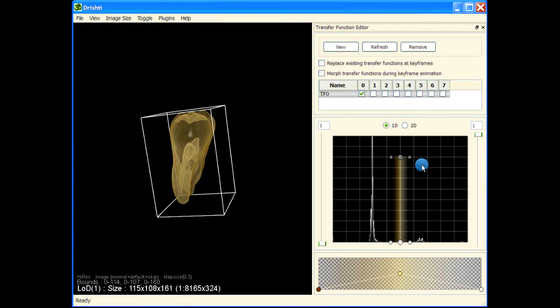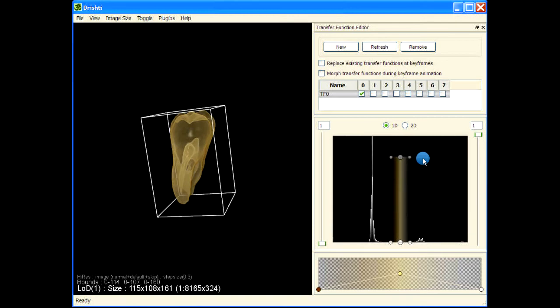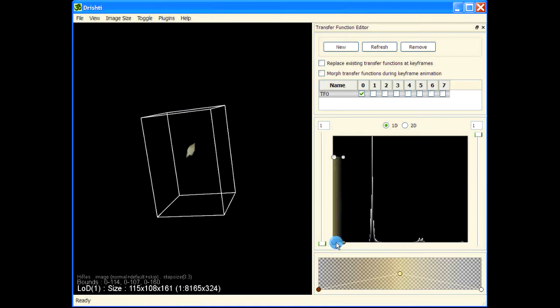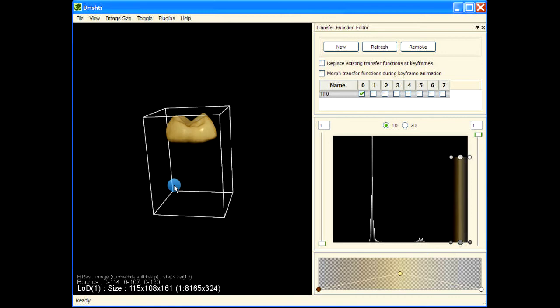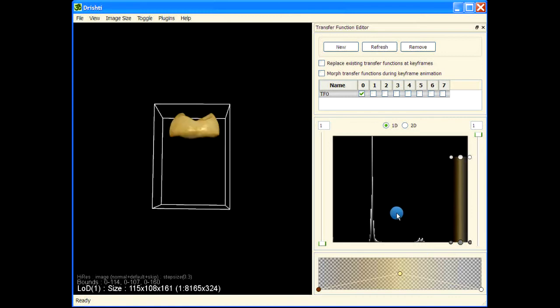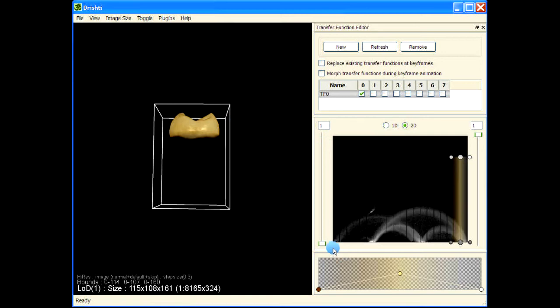I'm pressing spacebar to remove these markers and pressing G to remove the grid overlay. This is the 1D histogram. There is a phase here, a tiny line here, then a big chunk here, another chunk, and a tiny chunk — so there are four phases in this dataset.